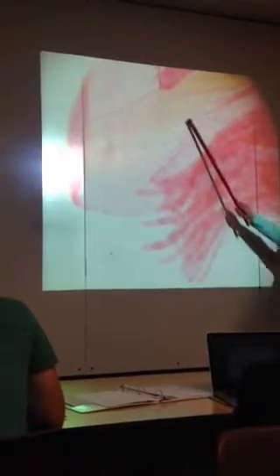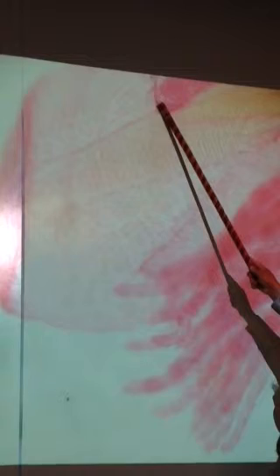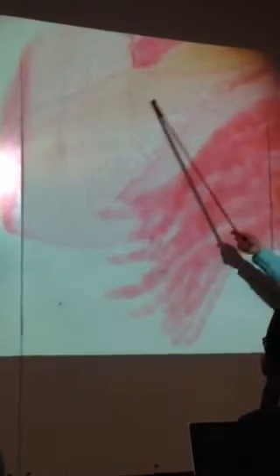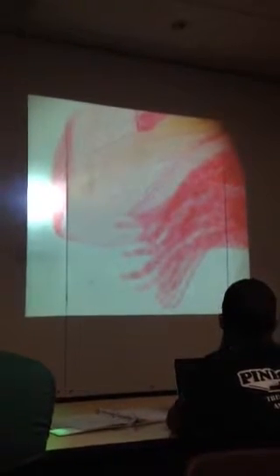This shows you those lines in the notochord I was telling you about. It's actually a series of little discs of tissue going back, but you can clearly see the vertical lines. That's why I like the way they drew that one. And again, notice the flagellated pit right at the top, and then there's the pigment spot. I've seen more impressive pigment spots in my life, but that'll get through. I think this one would be used for these right here. That's probably what I would use, or I could do the notochord.